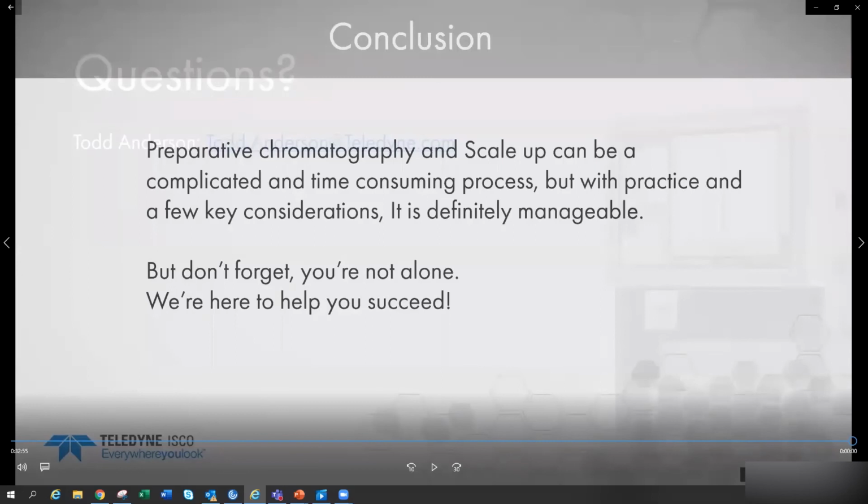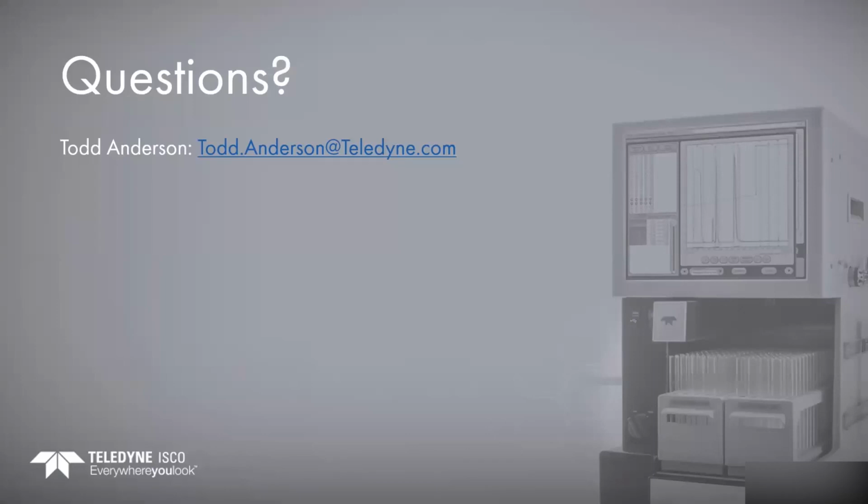I do want to also mention, I forgot on these slides, the SFC portion. Acetonitrile was also another modifier I've chosen in the past and ran with those, but it didn't show any results that were beneficial or any better than what we were able to get with methanol or ethanol, so I just left them out. And I also want to apologize because it looks like with the lag and timing of Zoom, my pointer that was magnifying things was glitching on me, so I apologize for that as well.